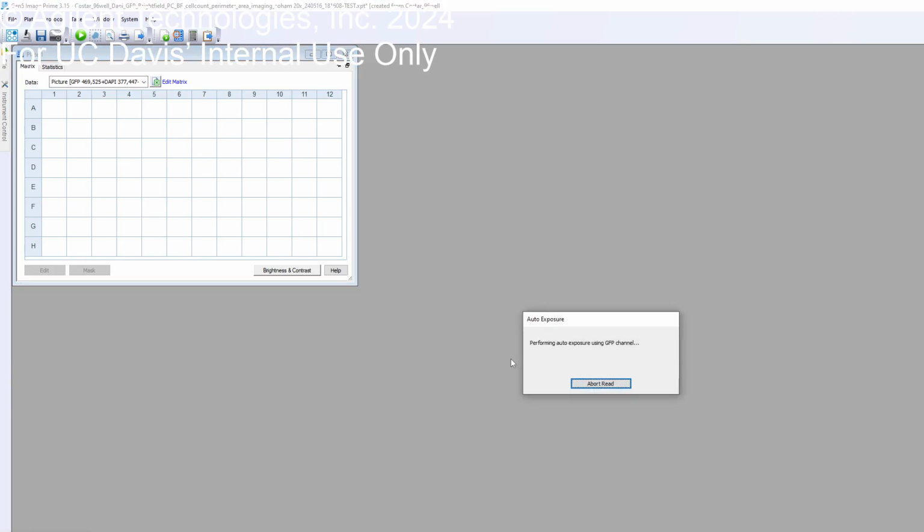So the beacon is going to take an image from the same spot of the well for each well. We can even combine beacons with montage. So if you want to do like a 4x4 in those 9 locations, you also check on the montage.